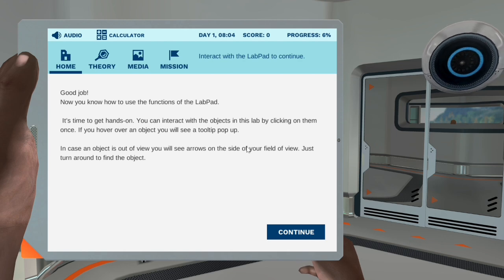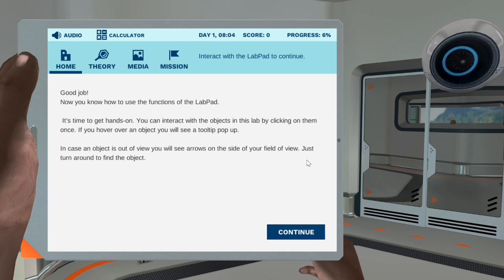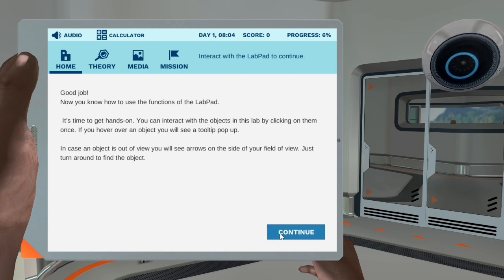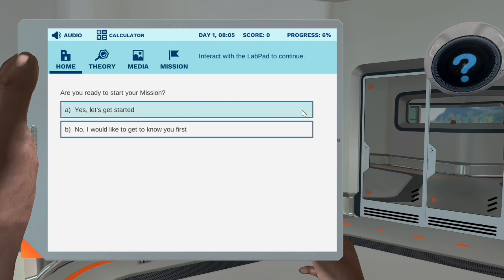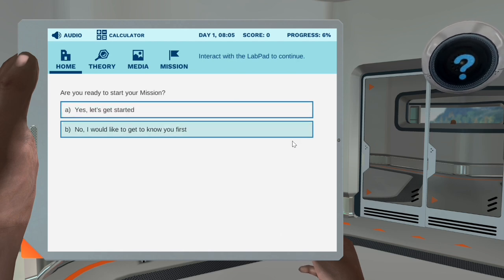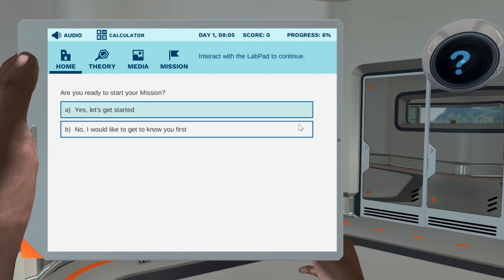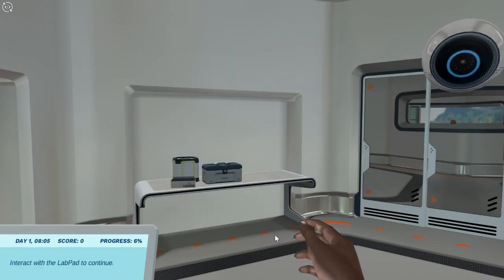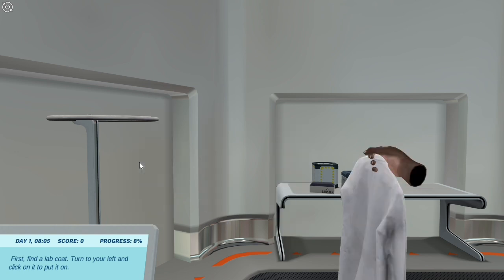It's time to get hands-on. You can interact with the objects in this lab by clicking on them once. If you hover over an object, you will see a tooltip pop-up. In case an object is out of view, you will see arrows on the side of your field of view — just turn around to find the object. Are you ready to start your mission? Option A: Yes, let's get started. Option B: No, I would like to get to know you first. Then let's get started with your first mission. First, find a lab coat — turn to your left and click on it to put it on.